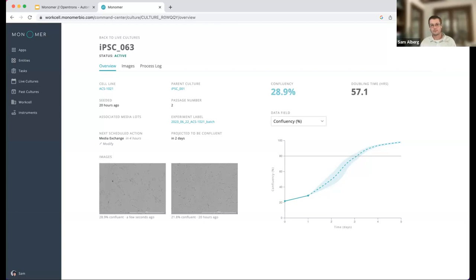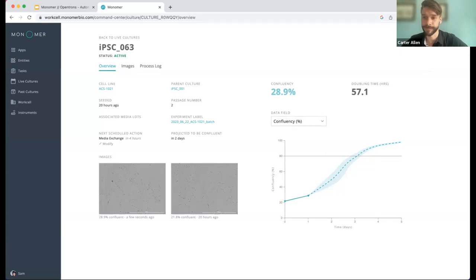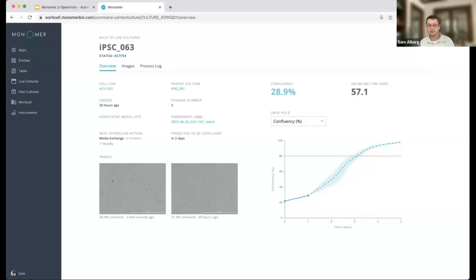Question here: you mentioned the Cytation 5 and the Thermo Fisher Attune as readout devices. Are there any instruments that are not compatible in a work cell? And the answer is yes. For it to be compatible in the work cell where there's a robotic arm, or at least the robotic arms that we work with, it has to be in a plate-based format. So any device that takes in an input as a tube only, and isn't modified to accept plates as well, would be difficult to interface with. If there is a specific assay type or instrument type that you're considering, feel free to email us. There are always little considerations, like how easy it is for the robotic fingers to access the plate loading position. We've worked with lots of them, so we can share tips and tricks.